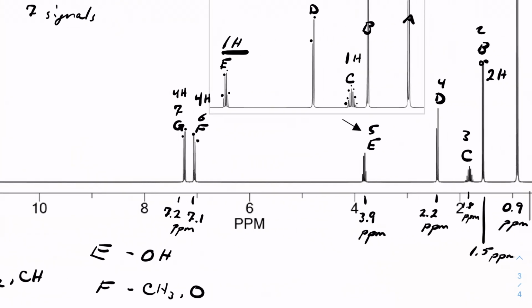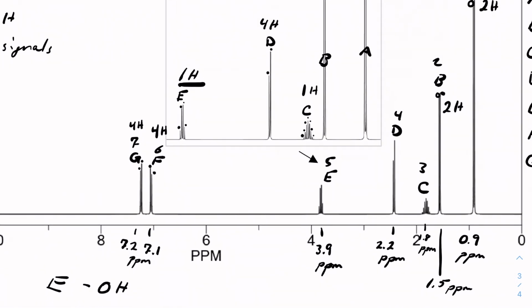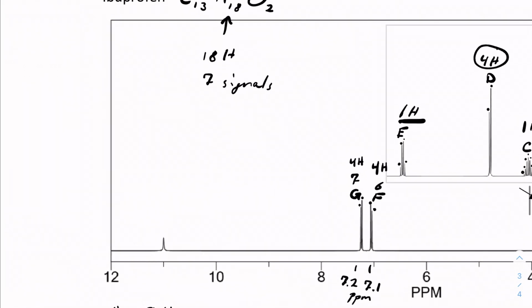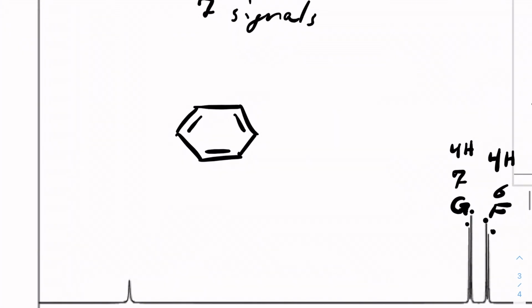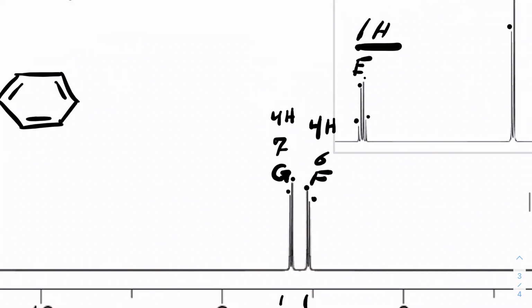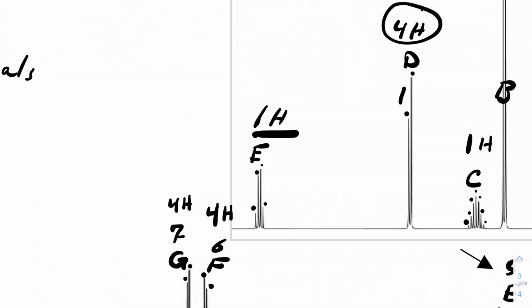So we know that we're going to have a benzene ring, and the way that we know that is that there's 4 hydrogens exhibiting in doublet pattern. And so we can start off and draw our benzene ring. Start that off right here. And so we have the double bonds. And so what we see from our benzene ring is that we have 4 hydrogens exhibiting 2 doublet signals.